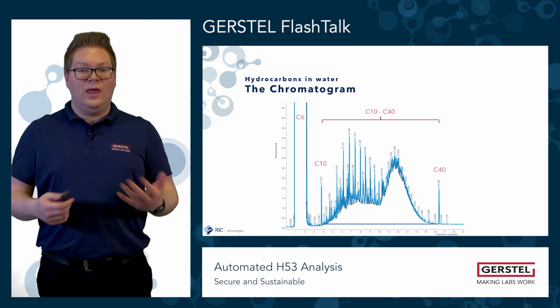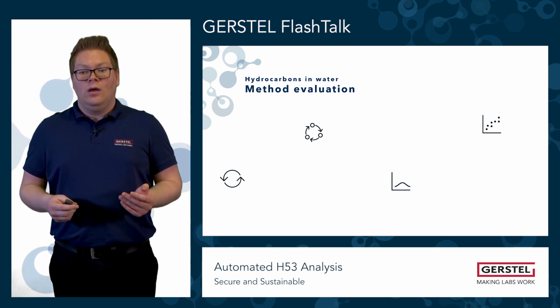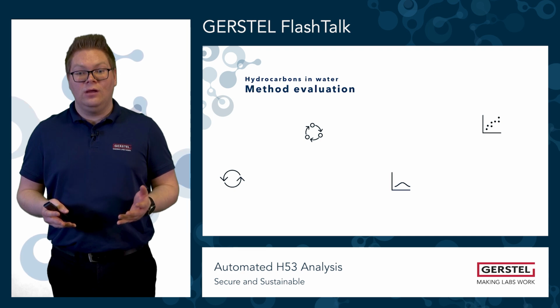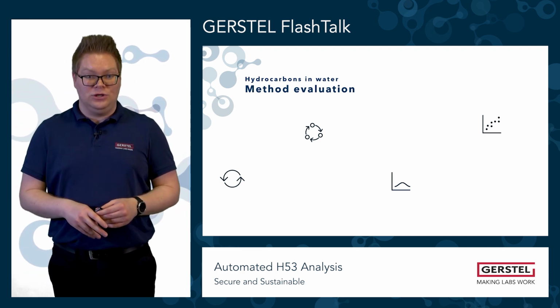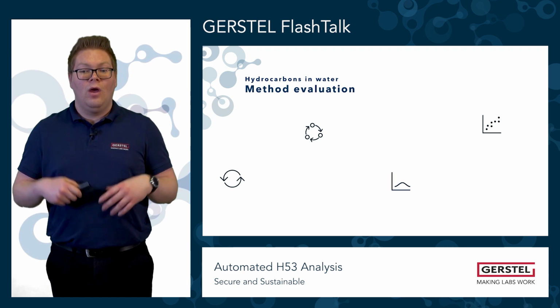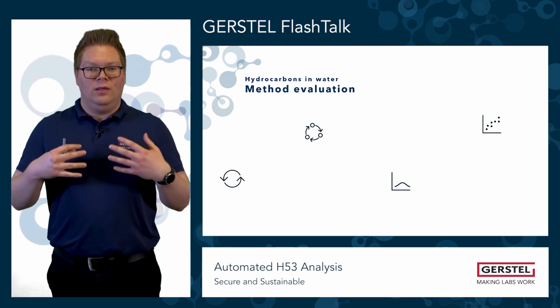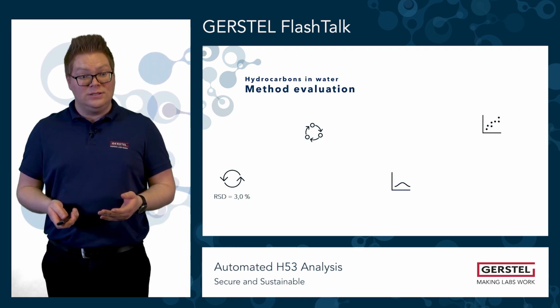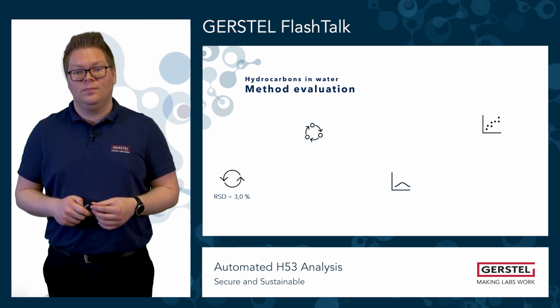Our partner, the RIC group, evaluates the method by determining repeatability, recovery, the LOD and LOQ, as well as the calibration. For the repeatability, they looked at 6 different runs, and the RSD of the repeatability was 3%.